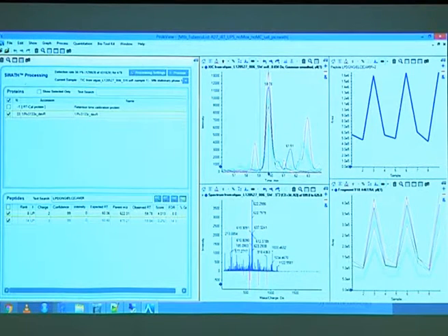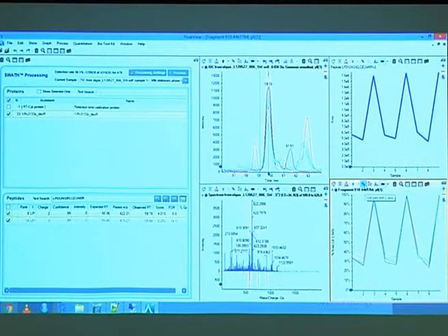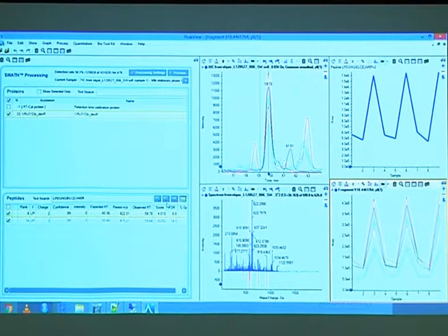Relative intensity should remain the same, which they do here. It's actually, I think, one of the nicer cases. So if you show the percentage here, you see that looks much nicer, even on the spiking.